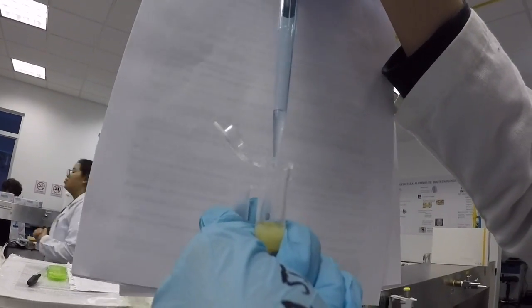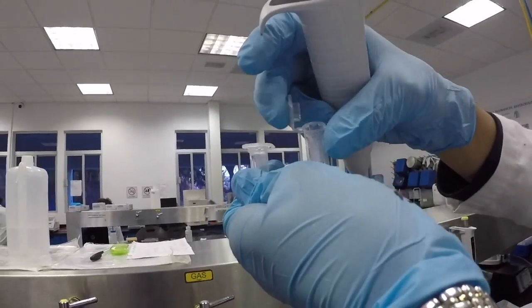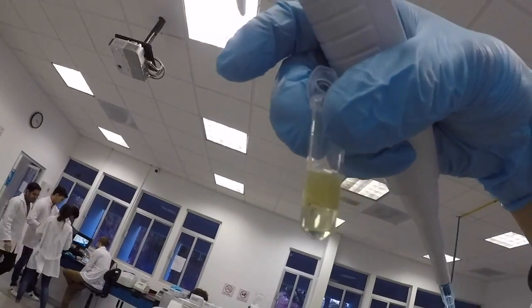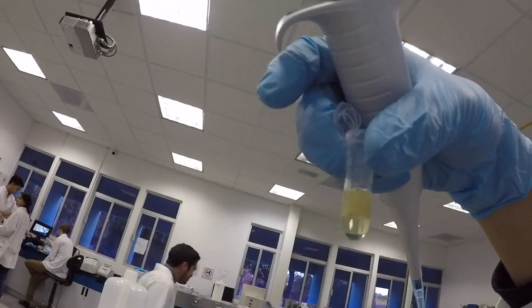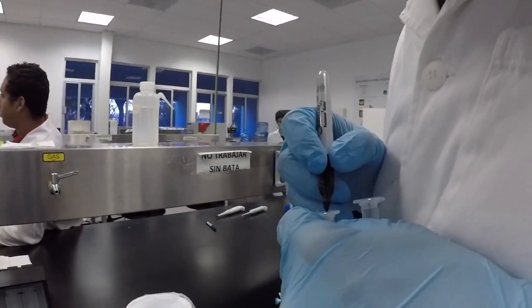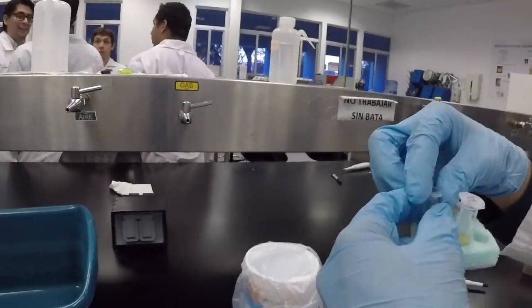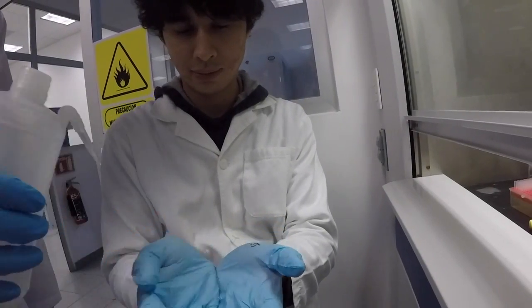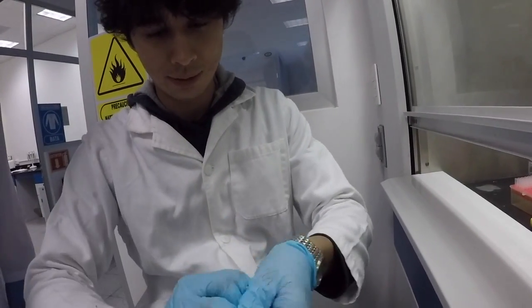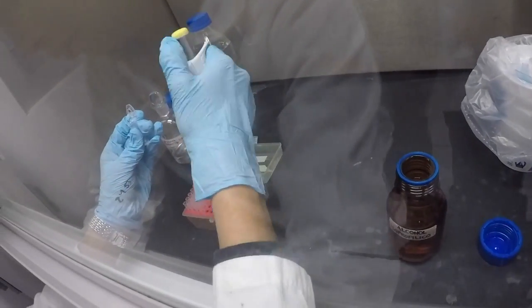Later on, one of the trickiest parts of the practical took place, when the team needed to pipette off the aqueous phase, taking care not to suck up any part of the middle or chloroform phases. The separated aqueous phase was placed into a new labeled plastic tube. The supernatant was measured and found to be about 300 microliters. It was decided not to do a second wash this time.